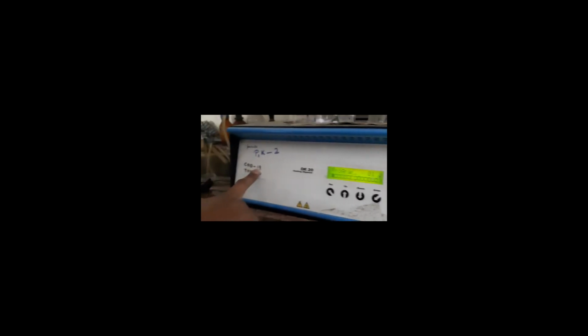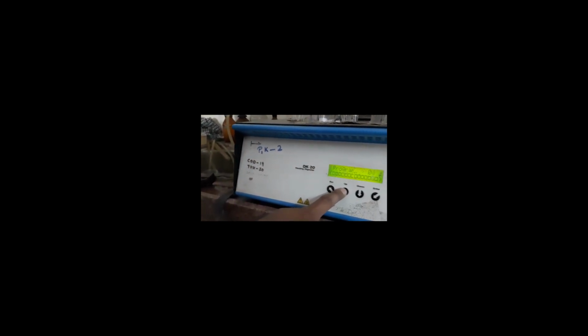Program, then press enter. So which program? Program number 19. So you have to press on 19, 17, 18, 19. Enter. Profile we don't want to check. It is at 150 for 120 minutes. Enter. Enter.